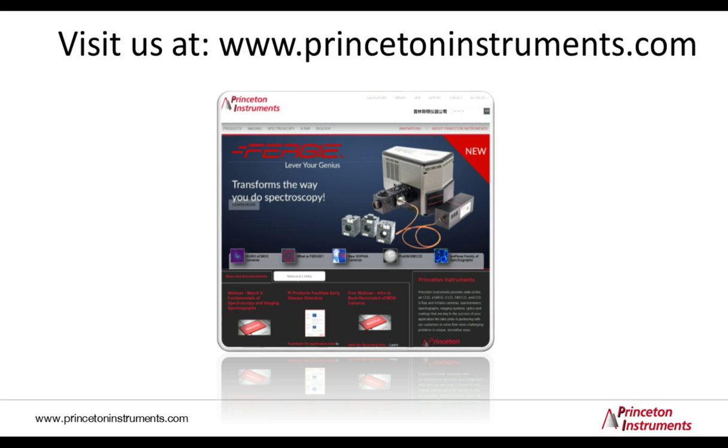Yeah, it is very weak. For example, in the Raman spectra I've shown in the presentation, the gratings were moved so that the laser line is just not seen. In addition to the dichroic mirror, a long pass filter was used, and each of those filters has an optical density around 5 or 6.